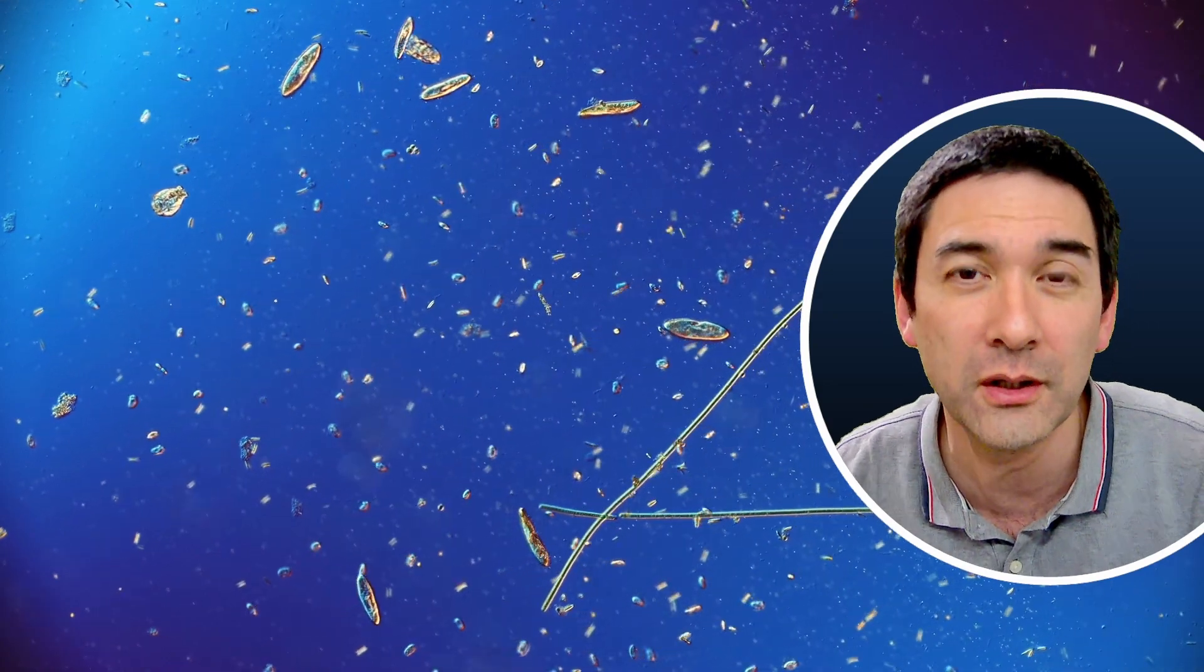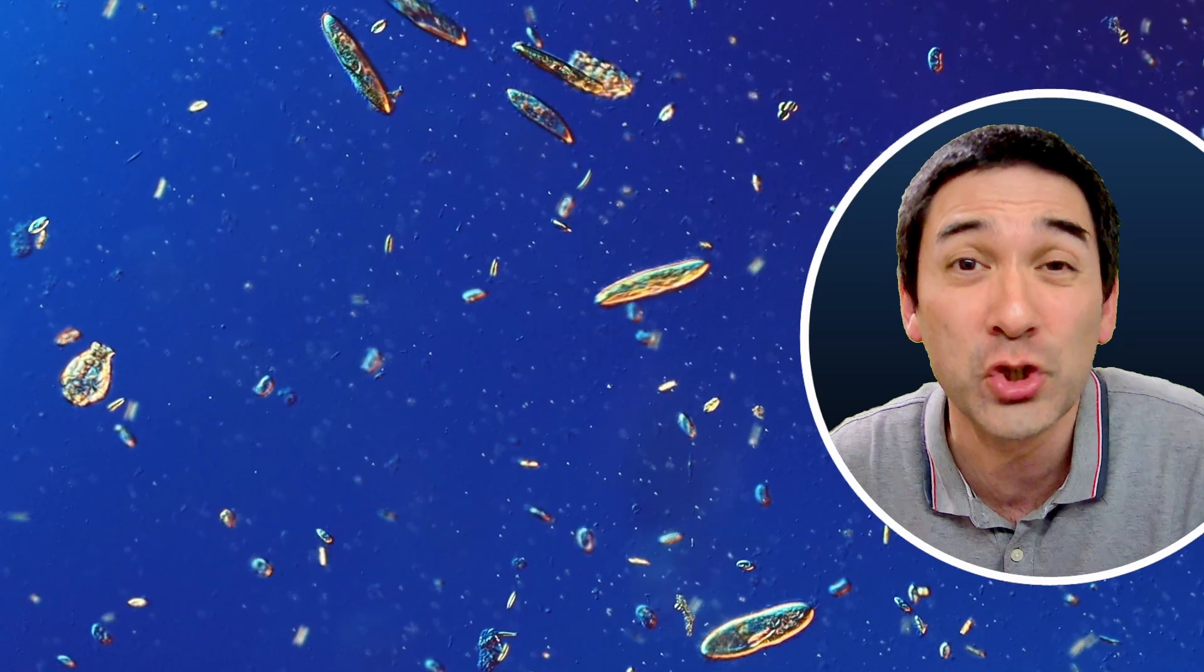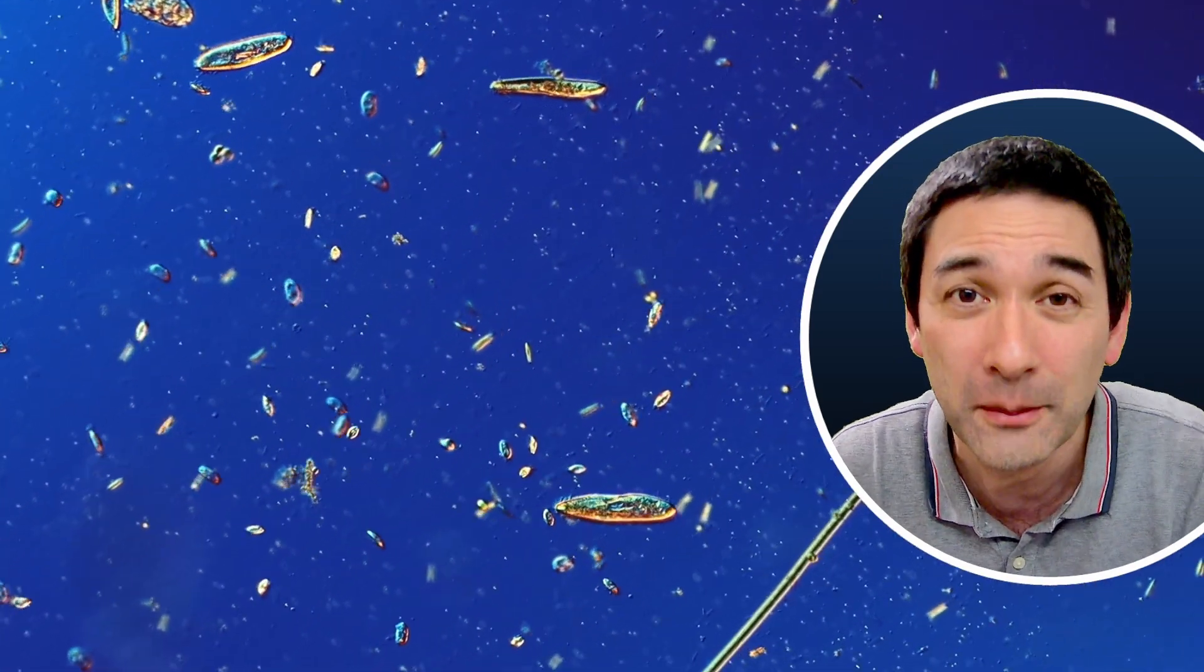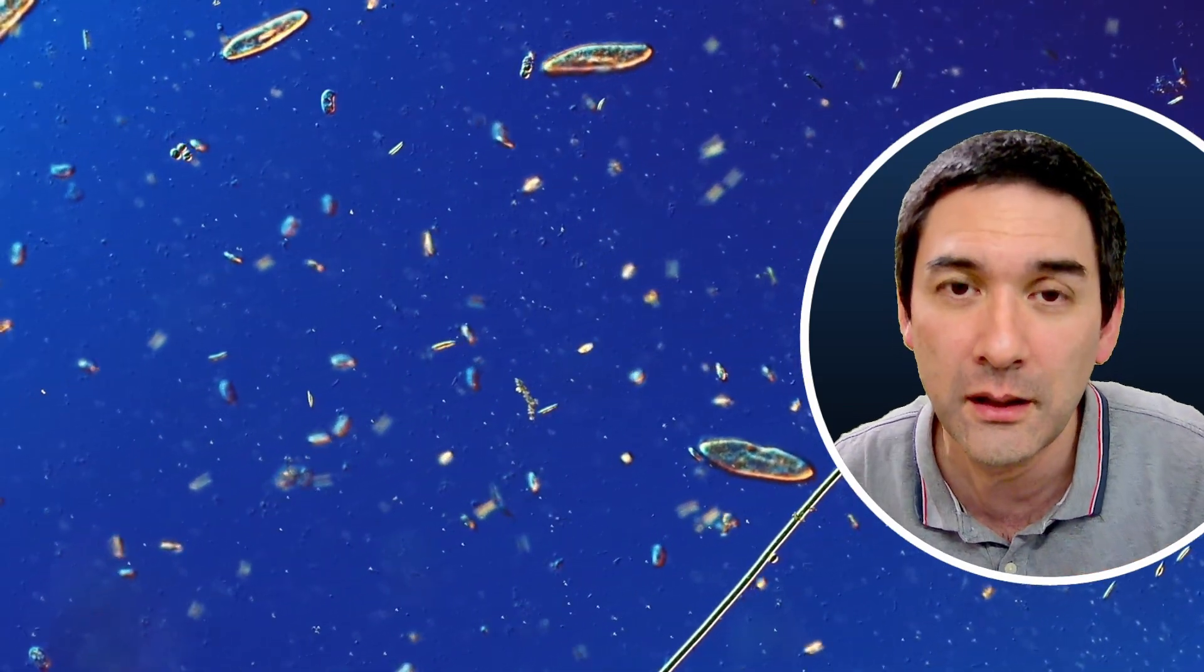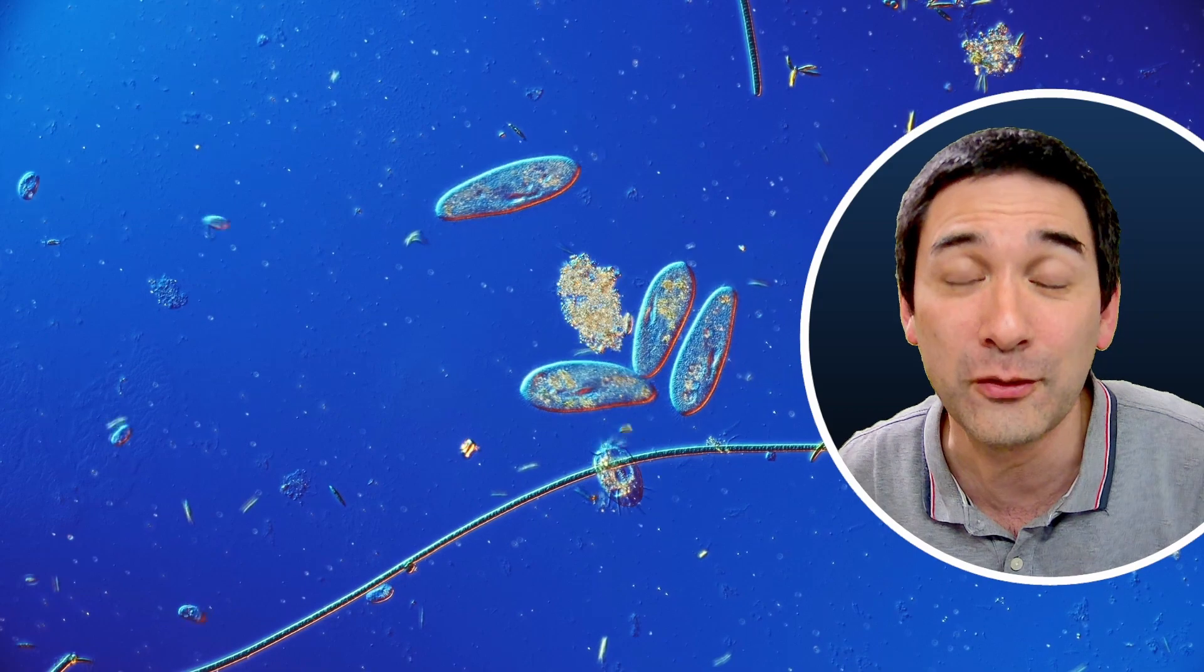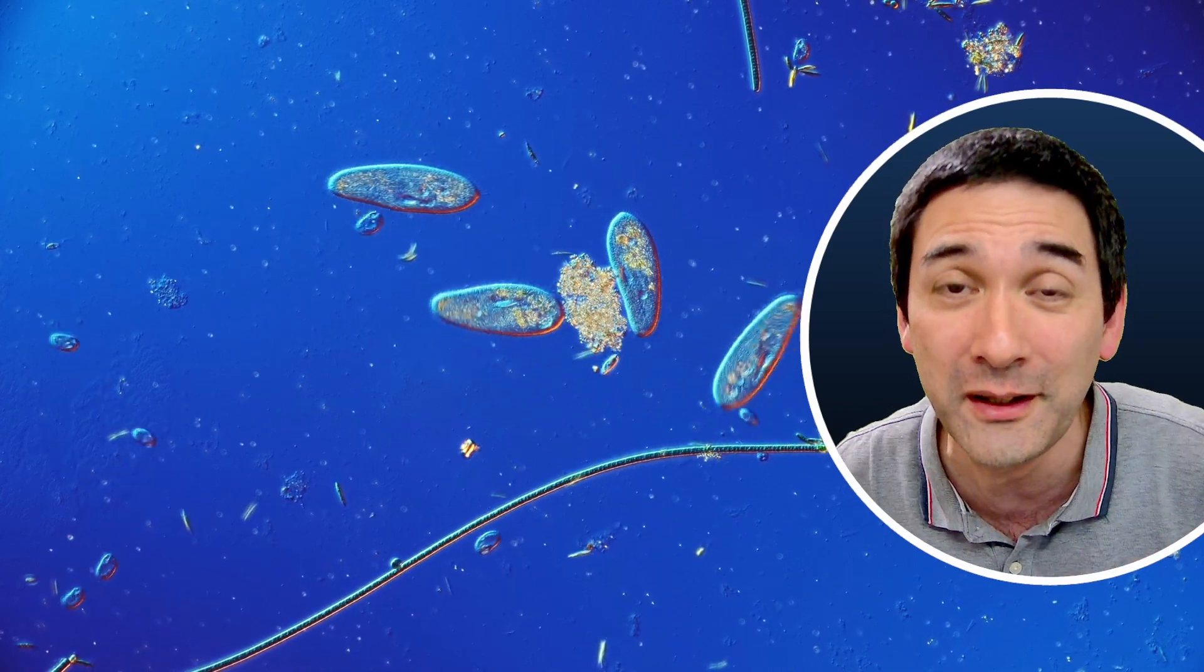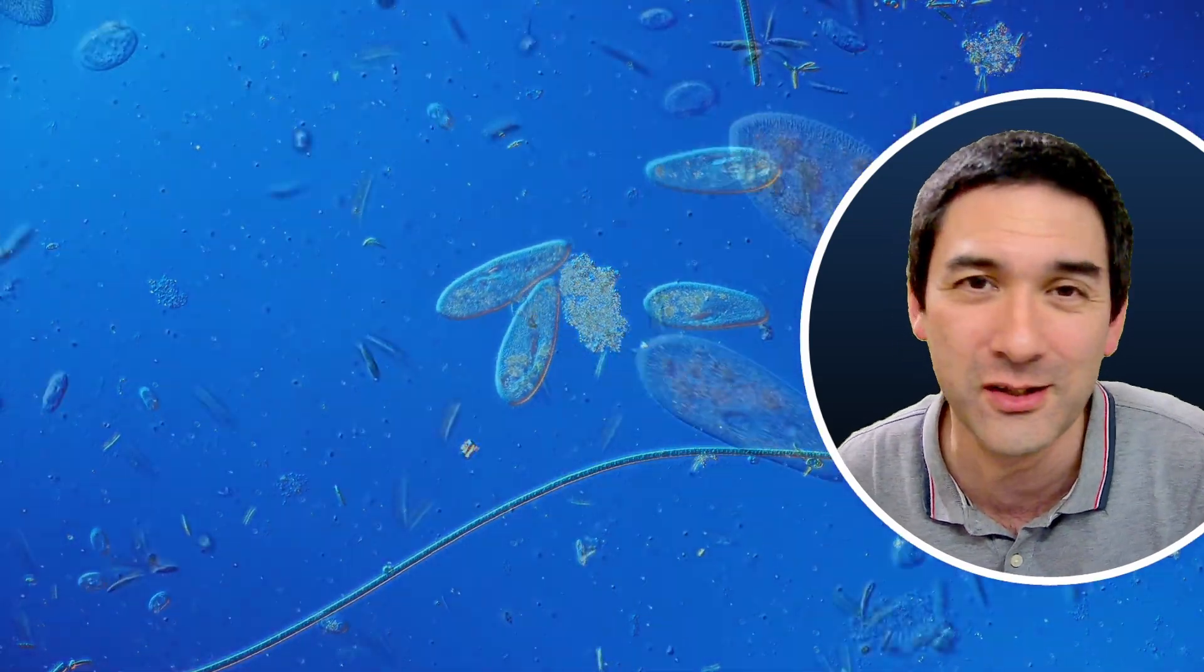That's it. They stop moving. And because not only due to the loss of water, but I can imagine that also the salt itself causes quite a few problems with the cells. Probably also messing up some other metabolic pathways inside the cells. And there is no possibility to revive them. As you can see, the microorganisms, they need their appropriate surrounding. And those freshwater microbes, they don't like to be in salt water at all.